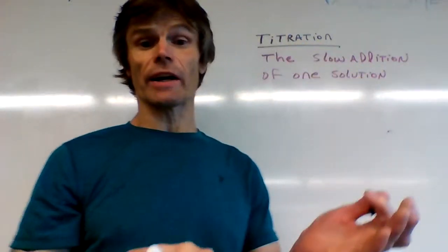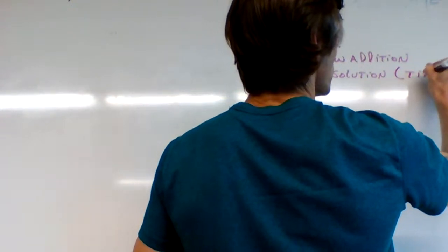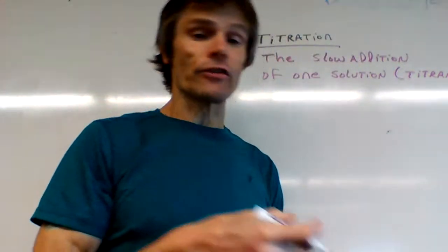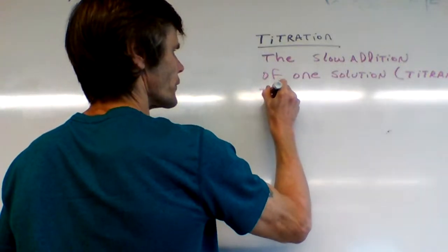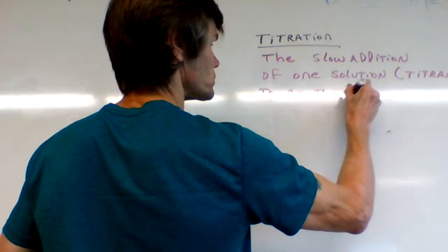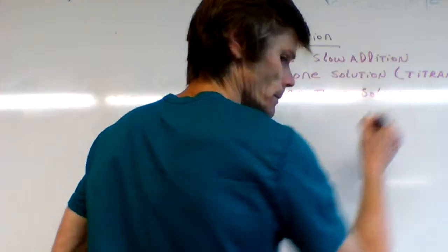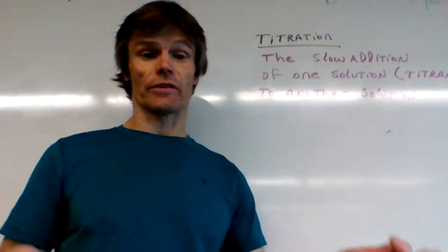We're going to call it our titrant. And we're going to add this to another solution until the reaction that we're focusing on is complete.